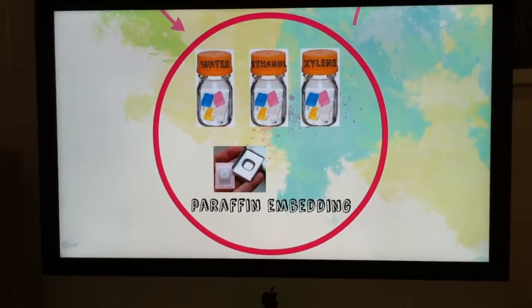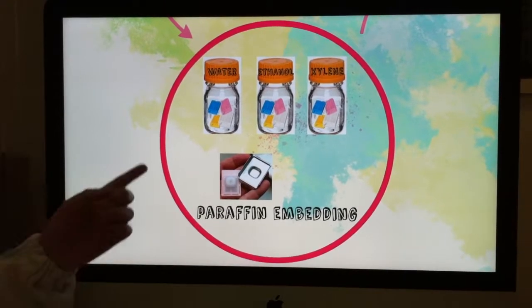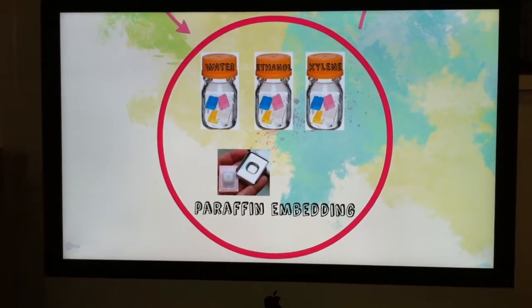Later, it will go into a different battery of baths — in this case water, ethanol, and xylene — and after it, we will embed it in paraffin and it will stay overnight again.